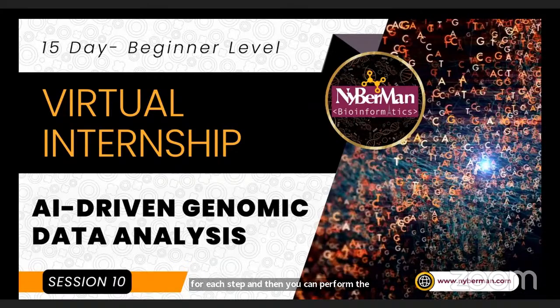But for this mini project, please stick to microarray data, so that you will have the conceptual understanding and also the hands-on practice for the analysis that we have performed. Analyzing microarray data is the basic starting point for gene expression analysis whenever we start with this type of studies.